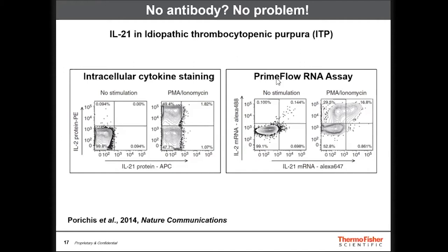And so this is one example of a case when they used this. We've had people do this for a variety of unique models, bats, catfish, lots of other things where there just aren't a lot of antibodies available. So this can be a nice quick way if you need to get an answer fast, rather than waiting to generate your own antibody or something like that.